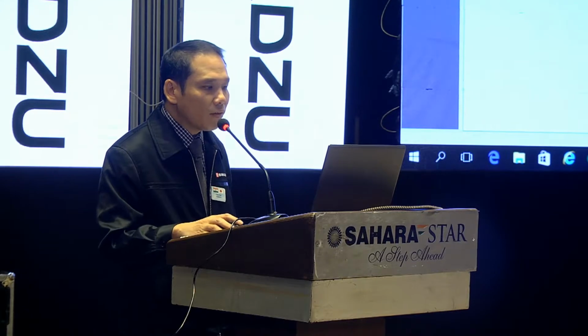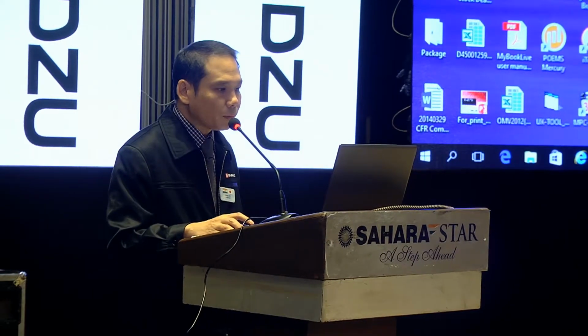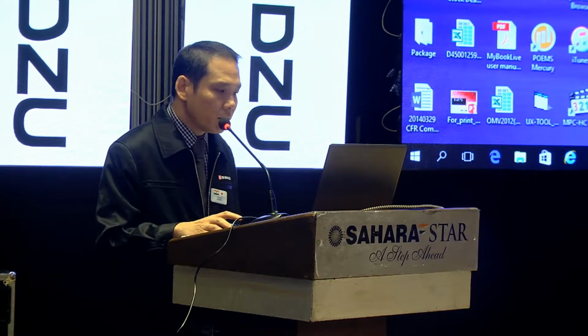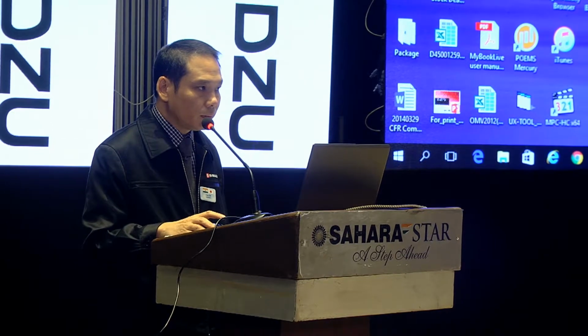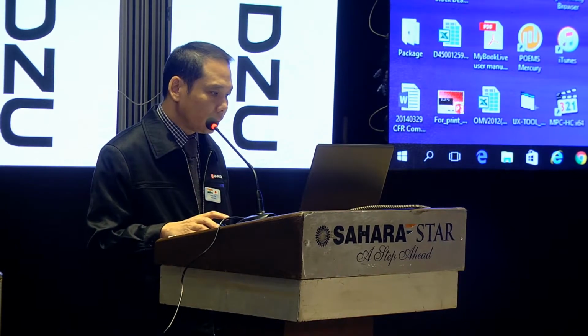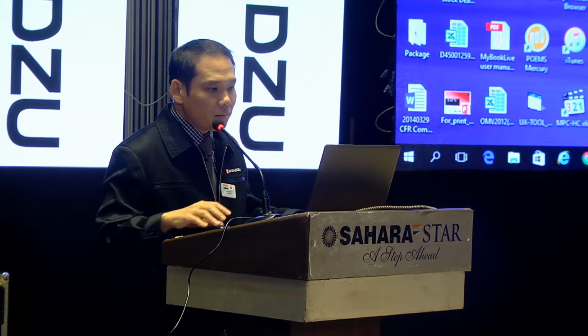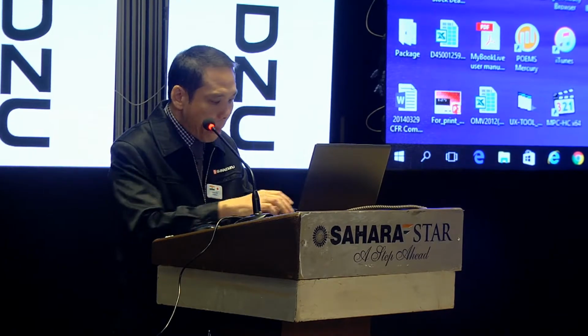Okay. So after you create the user, now you can start using Lab Solution Balance DB. You open up the Lab Solution Balance. So before you can let the new user use the Lab Solution Balance DB, you need to set permission for this user.